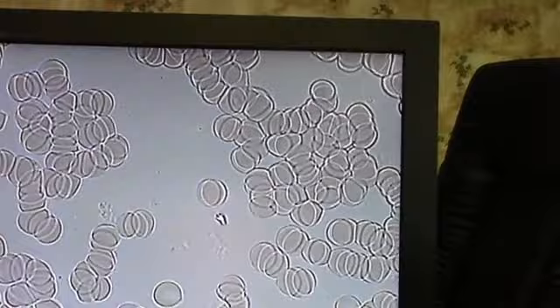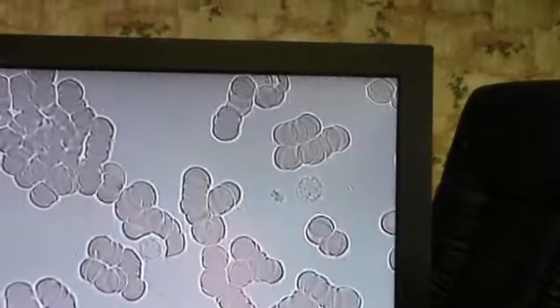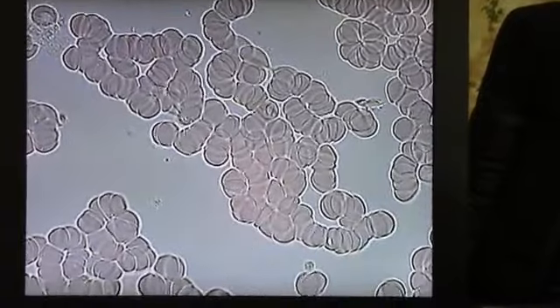I'm actually surprised there's not as much uric acid in there as what we're seeing. So the uric acid is just a protein waste product that kind of accumulates over time when you're not breaking down and processing the proteins as well. What that basically does is build up in the joints and muscles, and can create arthritis, gout, kidney stones.